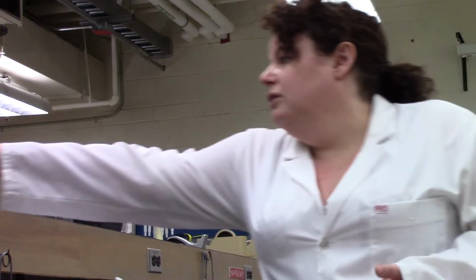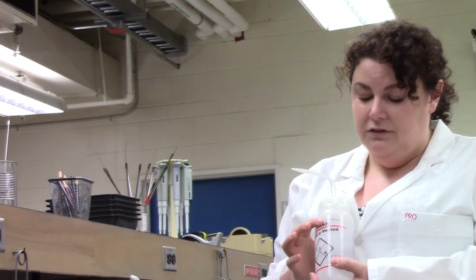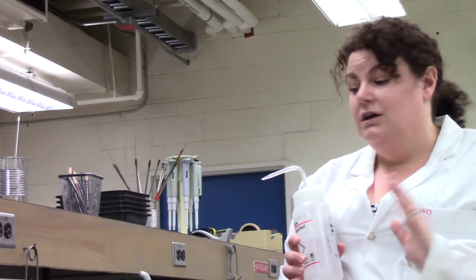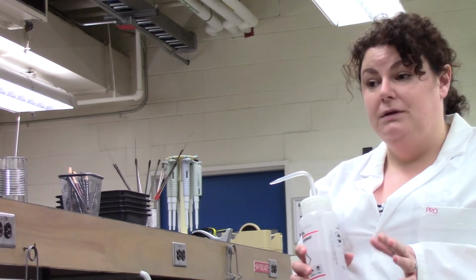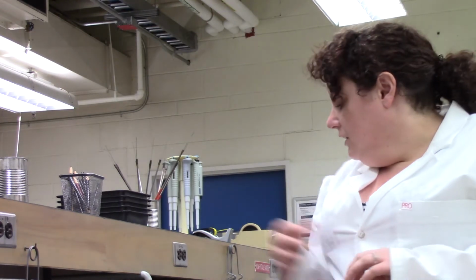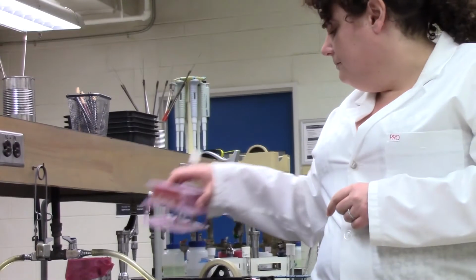Something that you wouldn't autoclave is anything that is flammable. So ethanol, something like that, anything that's like a compressed aerosol can. You wouldn't want to put that into the autoclave, that would be not very safe. So generally speaking, metals and glass are good to go. In terms of plastic, check with an instructor before putting it in there, unless it's one of these Nalgene test tube racks. We're giving you the go-ahead for these ones.